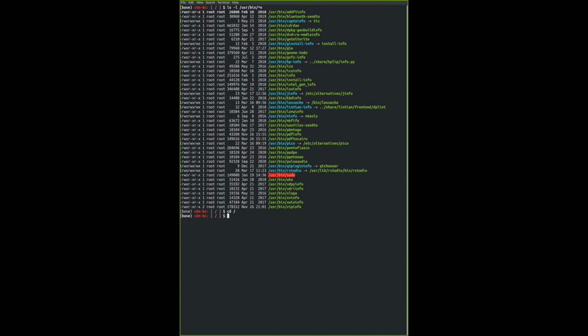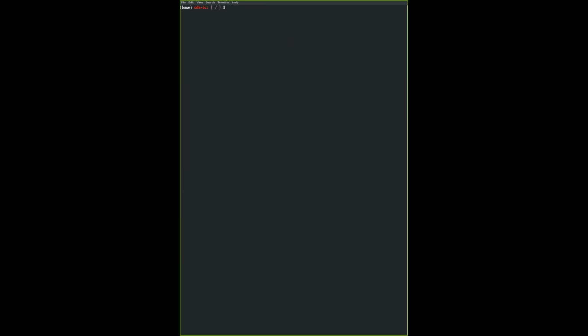The reason is because in your home directory where you were earlier on, there is no file or folder called bin. Based on the code that we typed earlier on, the bin folder has to be in your working directory. Okay, so we're still in root. It's okay, we're not too far behind.